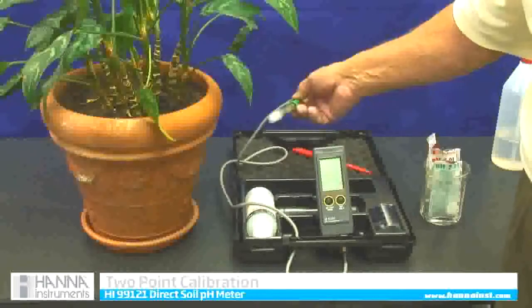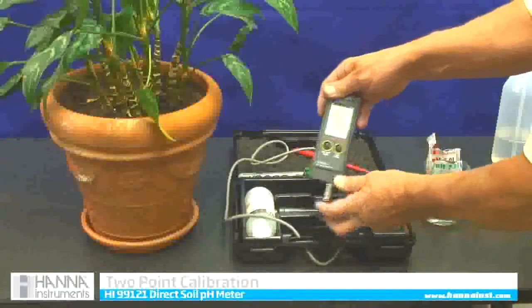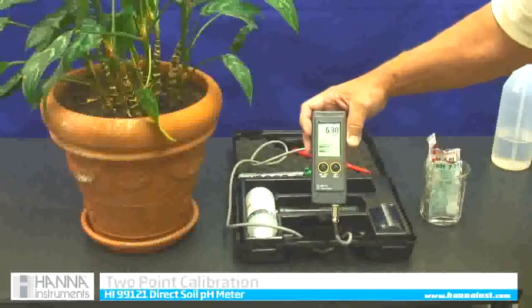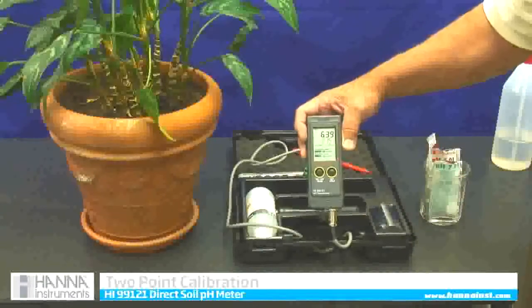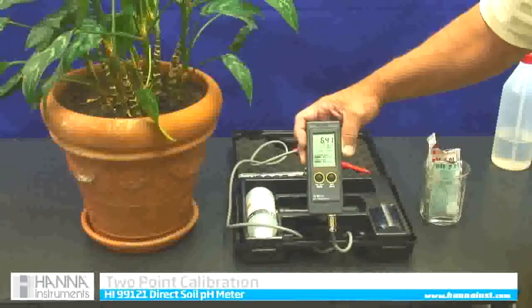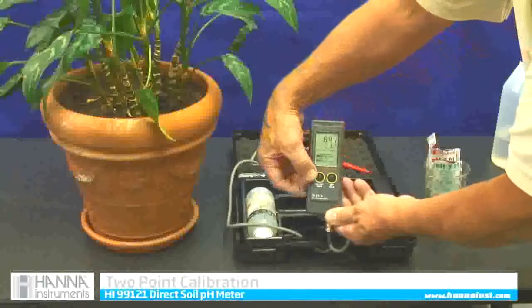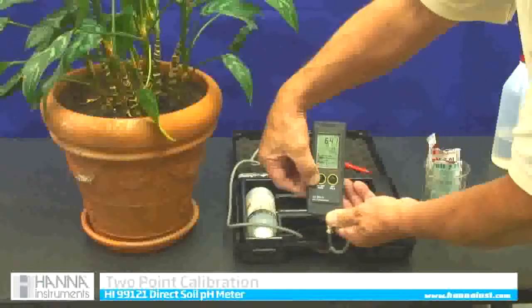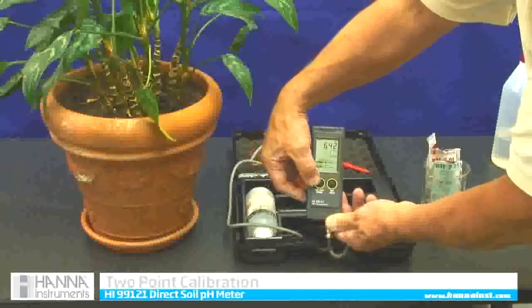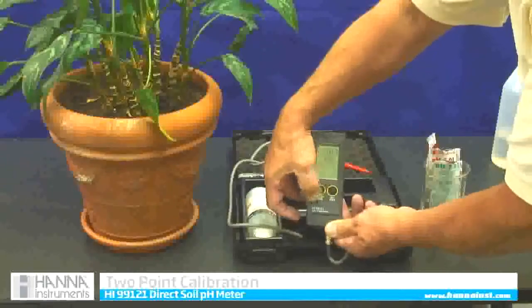To get into calibration mode, I am going to push the on/off button once to turn it on. We'll go through the screen, which will read something like 6.4. Now I'm in the on mode. To get into calibration mode, I am going to depress that same on/off button until C-A-L pops up. I will go past off — and there's calibration.